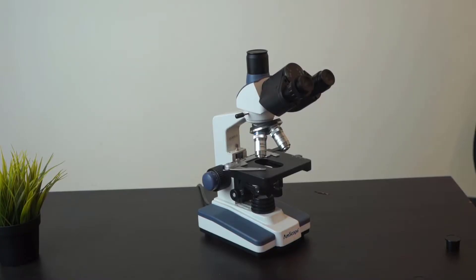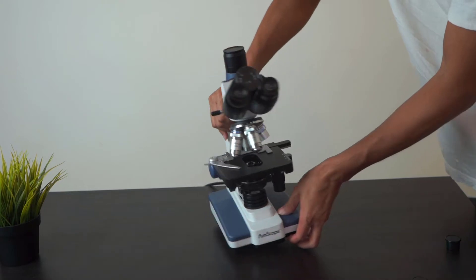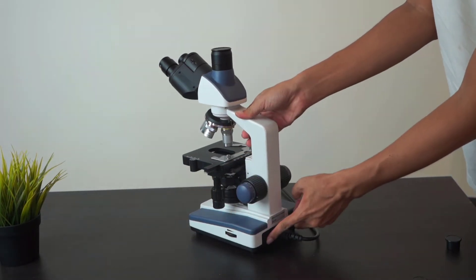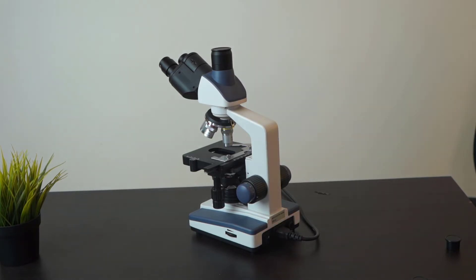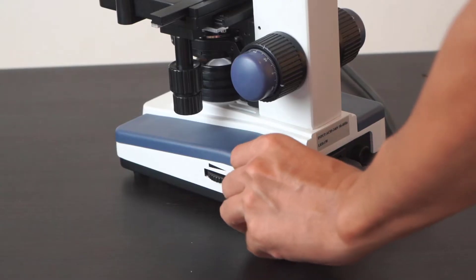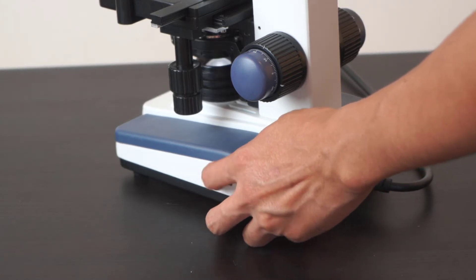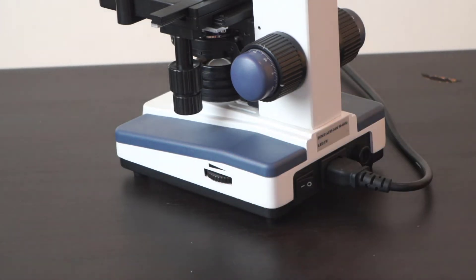To move the microscope, hold the neck and the bottom of the microscope. In the back of the microscope there is a switch which you can use to turn on the LED, and you can use the dimmer to control the intensity of the LED light.